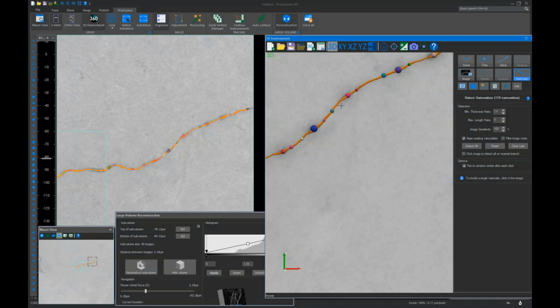So Alexandria is asking about whether or not the software functions with fluorescent image data, and yes, it does. We can show you that. Do you want to switch over? Yeah. We have one preloaded.